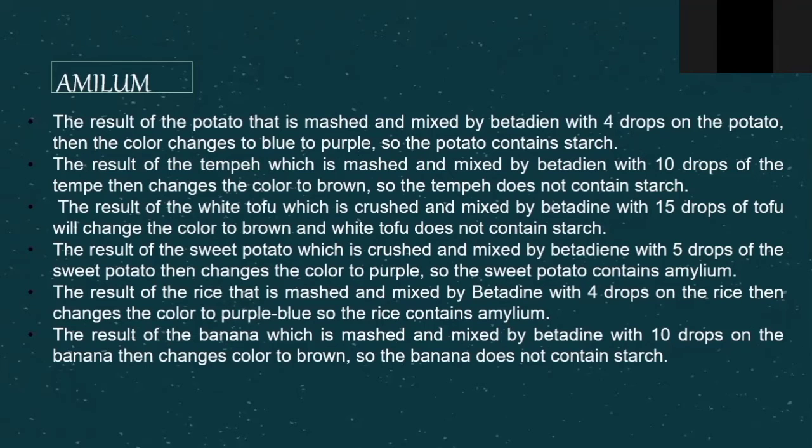Okay, thank you. Next, amylum. First, the potato mixed with betadine, 4 drops on the potato, then the color changed to blue-purple, so the potato contains starch. Second, the tempeh mixed with 10 drops of betadine changed the color to brown, so the tempeh does not contain starch.